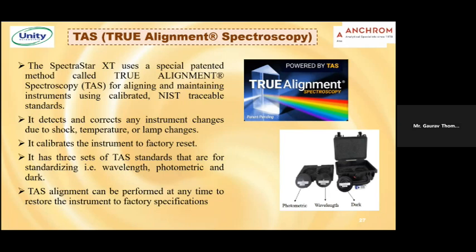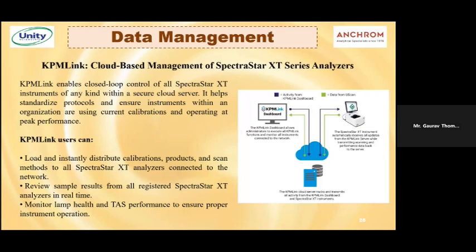Next, after calibrating the instrument and analyzing all your samples, there is data management. The data management has to be done properly, right? So here our SpectraStar XT NIRs come with this. We have another poll which asks how you like to monitor your analysis data.